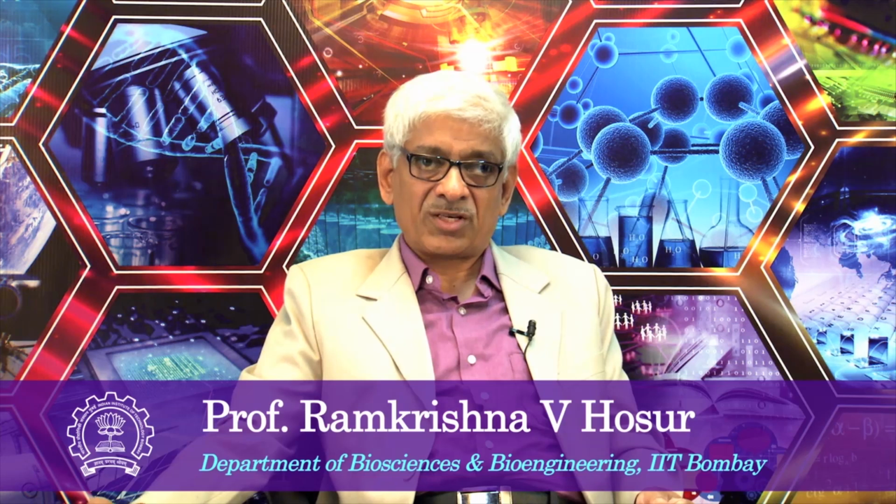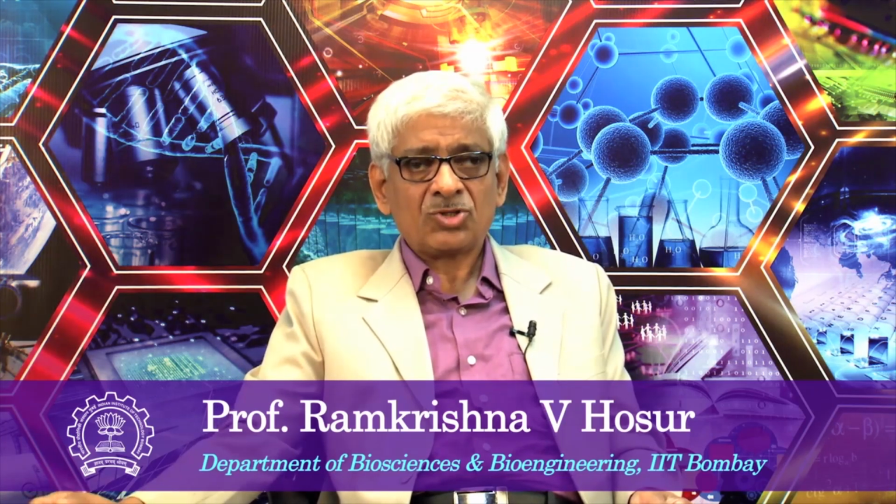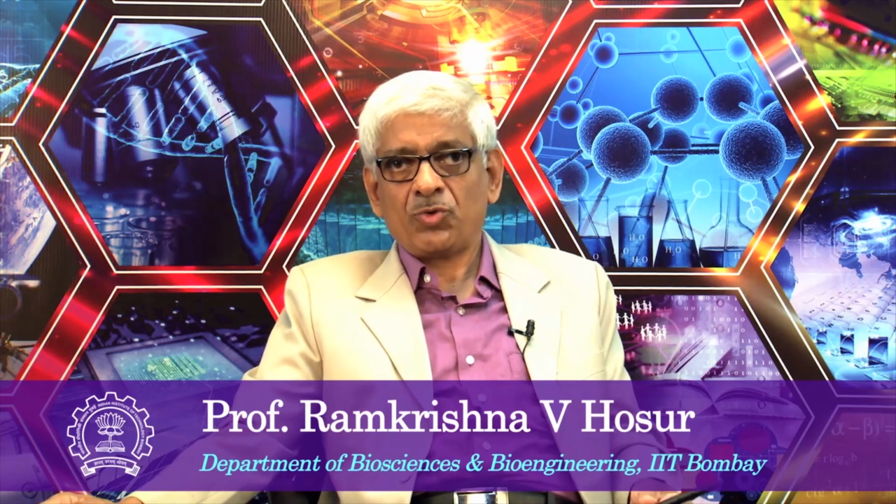So here this one is F1 equal to F2, this is the diagonal, and this is also diagonal, and this color represents F1 not equal to F2, and where this peak will appear depends upon what the interactions between the spins are and how the mixing transfers the magnetization between the spins. So we will stop here and we will continue with the theory of this in the next class.